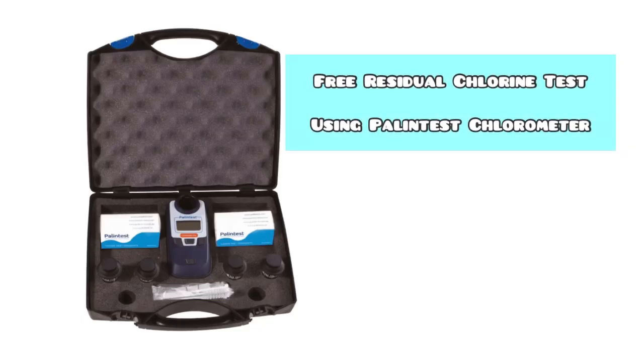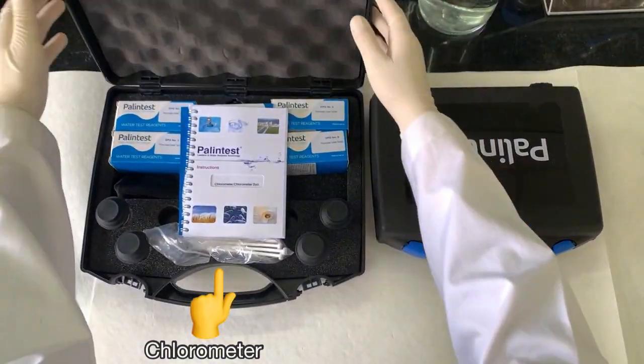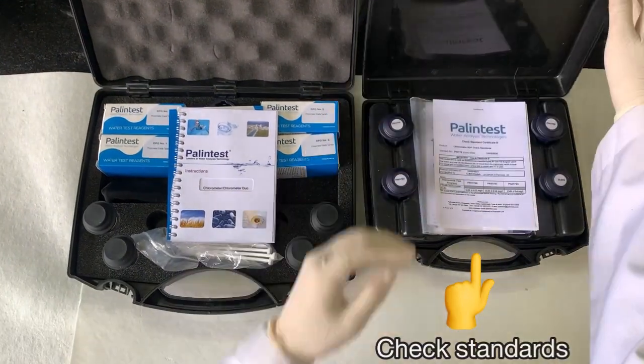Here is the procedure for free residual chlorine test in a drinking water sample using the Palintest Chlorometer. You have the Chlorometer and check standards.